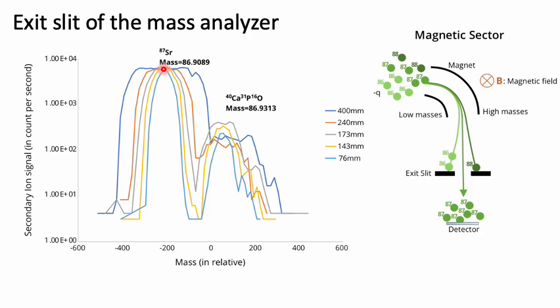You want a broad enough peak that you don't accidentally measure on the side of it, because it can also drift throughout the day. So at the beginning of your analysis, you want to put the mass you're analyzing in the middle of a flat peak, so that if there's any variation, you don't measure somewhere off the peak.